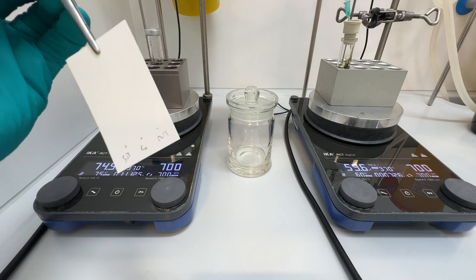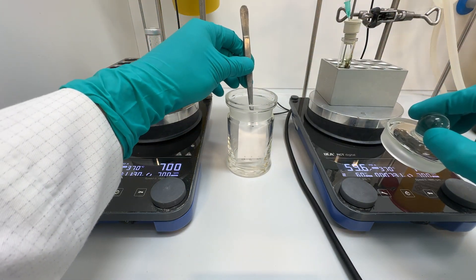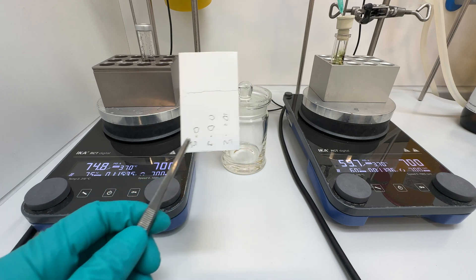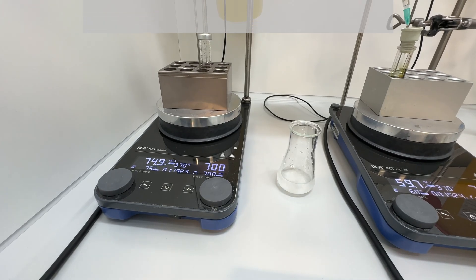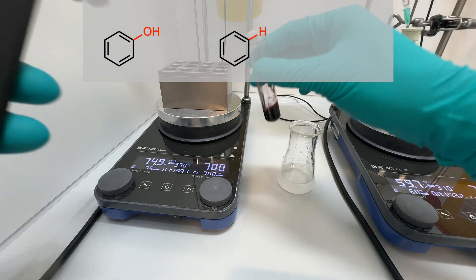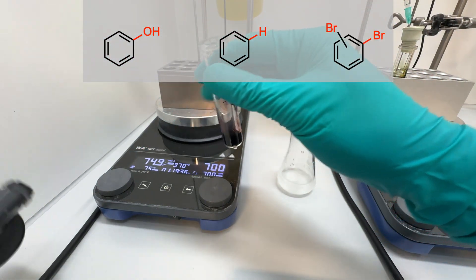I monitored both reactions by TLC. After 1 hour, the starting material was fully consumed in both cases. However, the TLC plates also indicated the presence of impurities and byproducts. To identify the possible byproducts generated during the reaction, I ran UPLC analysis. From the first trial, the main impurities were phenol and the protodeamination product. In the second trial, the main impurities also included the deamination product and a bisbrominated product.